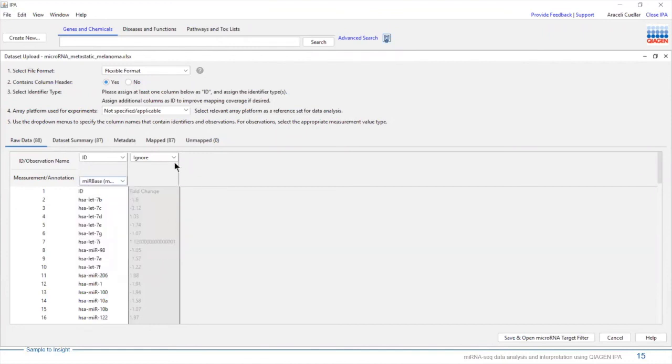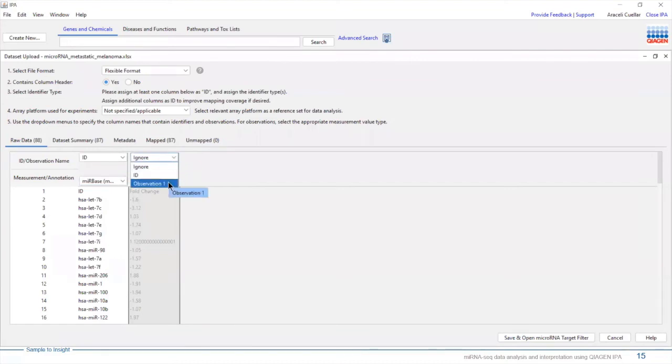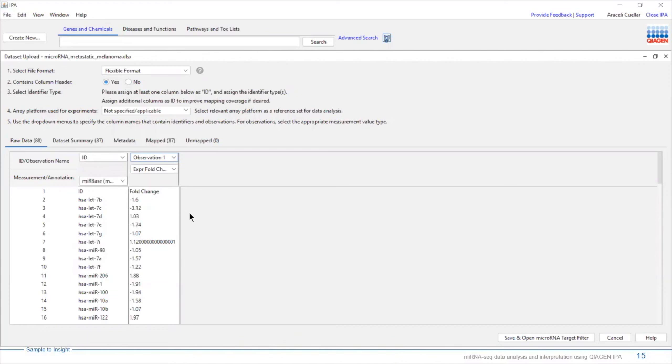I'm going to let IPA know that this column is going to be my observation column. Once I do that, IPA automatically detects that I have differential expression values. We're going to save and use this dataset with the microRNA target filter to identify mRNA targets for microRNAs with differential expression in melanoma. I'm going to click here, save this dataset.